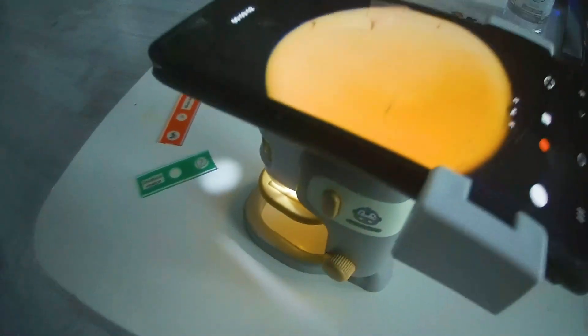So you can place all of these underneath here, turn on the microscope, and then take a closer look. And of course, you can place anything else underneath, and it does not require these plastic slides. We're going to place this right here, and you see there's a little hole right there. So if we place this right there.